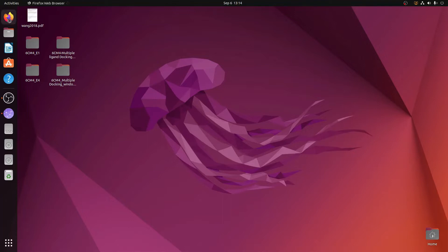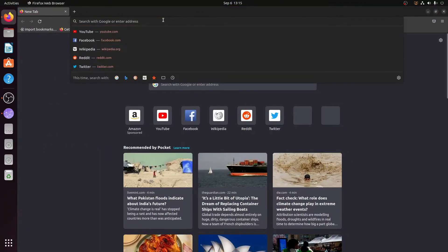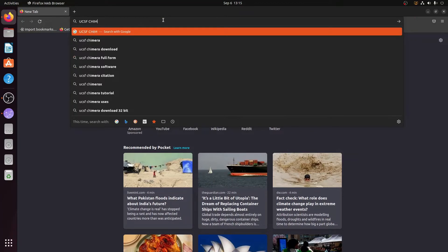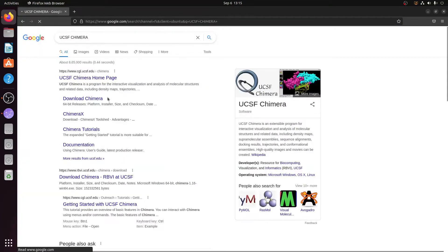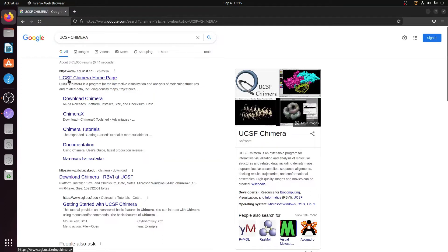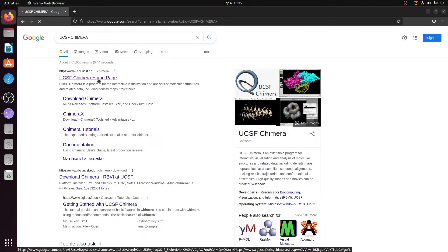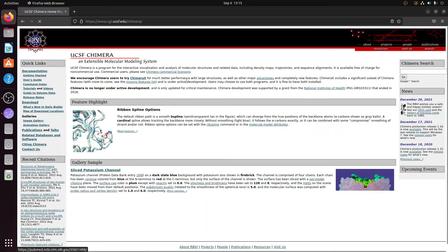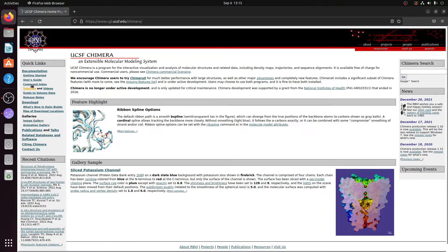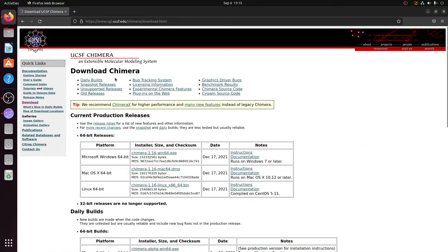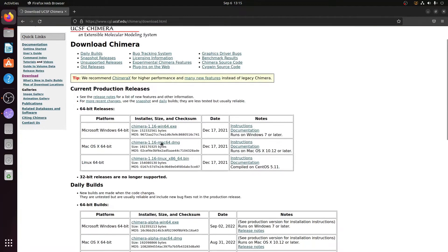Let us quickly begin. Go to the browser — for installation of UCSF Chimera we first need to go to its website. Simply type UCSF Chimera into Google and it will take you to the UCSF Chimera homepage. Click on it, and on the left-hand side you'll see the Download button. Press Download and another webpage will open providing multiple options for different operating systems. Since we are using Ubuntu, we will download Chimera 1.6 Linux.